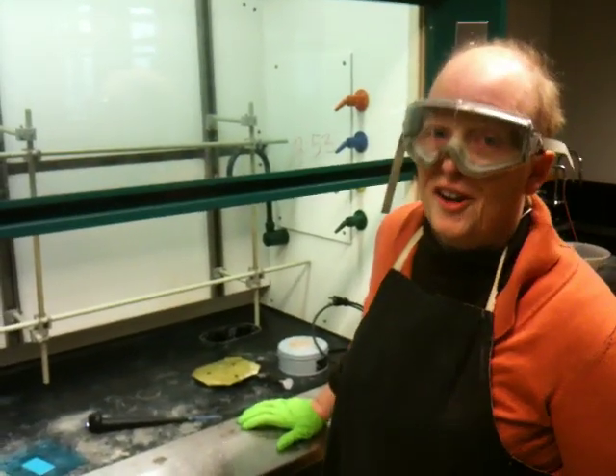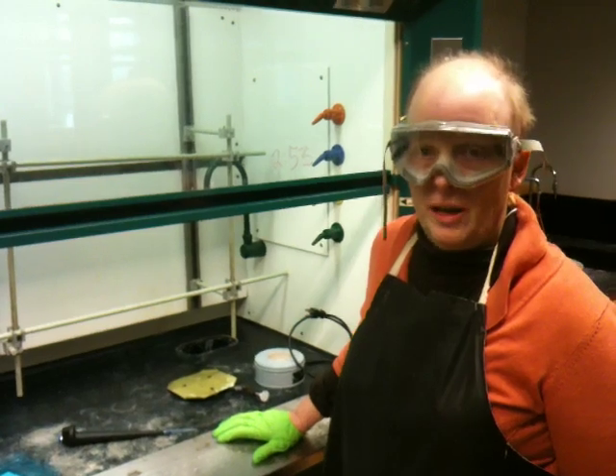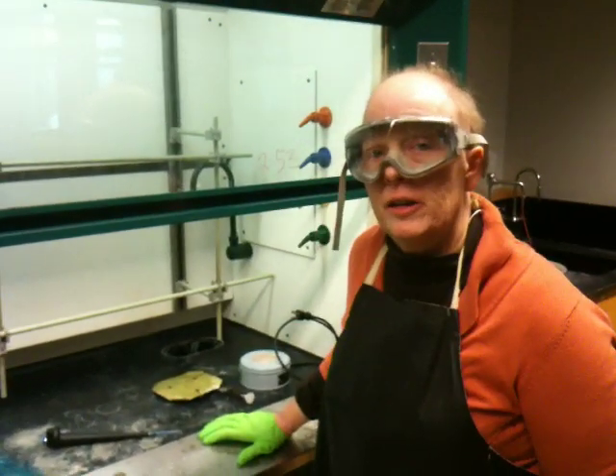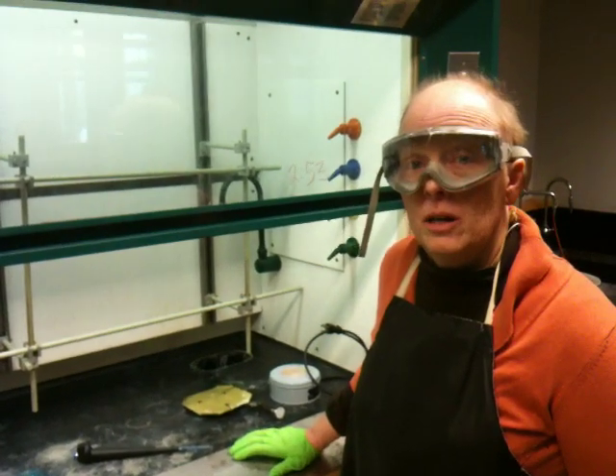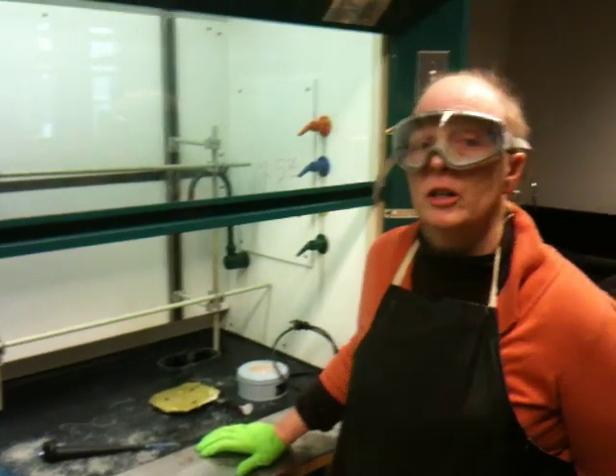Hi, this is Dr. Naruz, working hard in the lab, trying to come up with good videos for you to help you review and to help you learn new techniques. What I'm going to do here is build a still — basic still building 101. I want to make sure you know how to properly build a still when you leave your courses here at Bremer College.